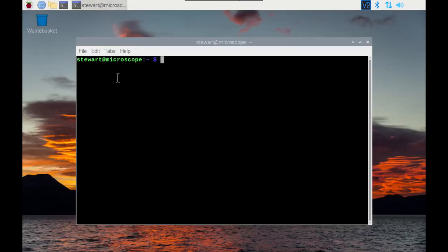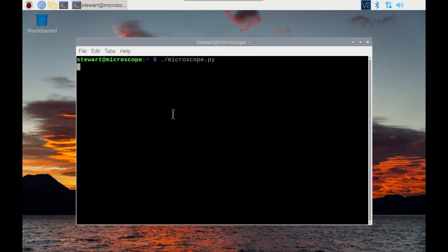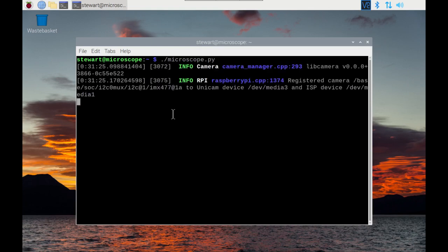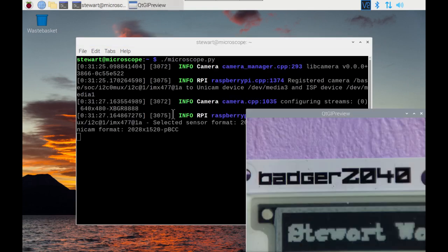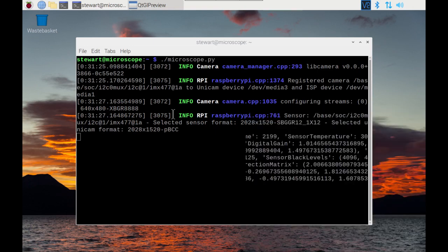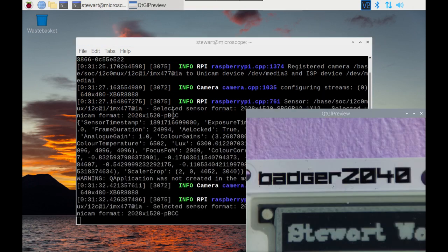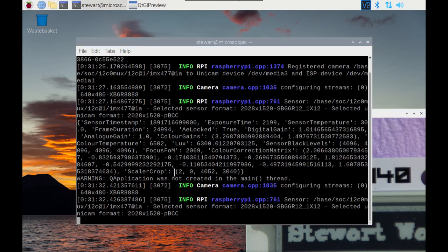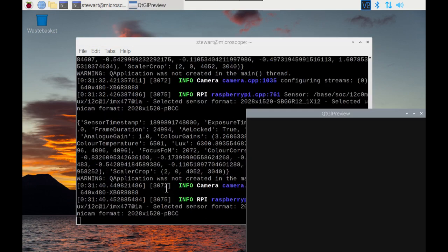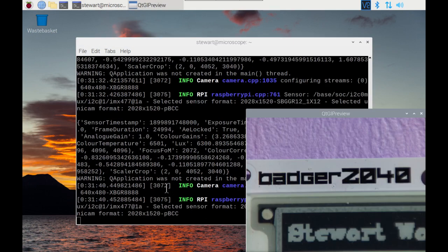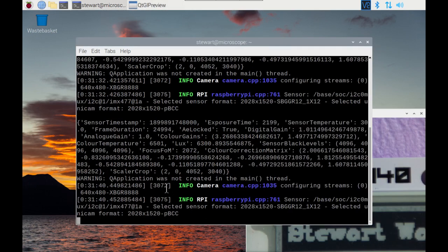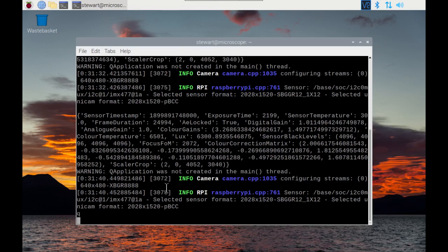However it does work correctly on the command line. So if we go to, I've named it microscope.py. So we've got that running, got the preview again. Press the button, press the button, it captures it. If I want to use the keyboard I do have to click onto here, but then I can click enter. And if I want to quit I just press Q and enter.